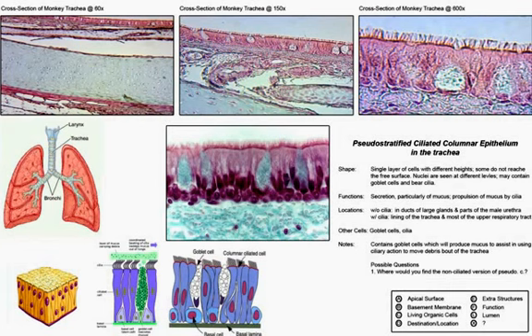This is a view also of the bronchial tree that we were looking at before. It's just a closer look at the lining of the airways that lead into the simple squamous lined air sacs or alveoli. So as we showed before, as the air moves in to our airway or our voice box, the larynx, we're going to bring that air through the trachea, and the lining of this area that leads into these branched portions that eventually lead into the alveoli consists of pseudostratified ciliated columnar epithelia.